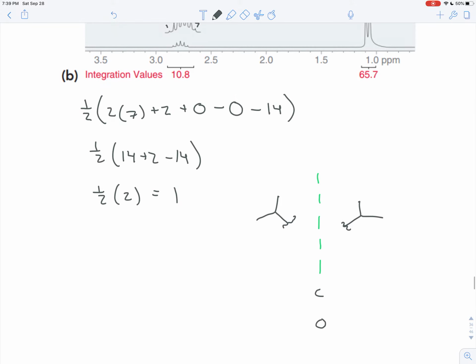All right, so far these are our pieces. Now this carbon must be going in the middle. After all, neither of these can go in the middle. They only attach in one place. To go in the middle, you'd have to attach in 2 places.